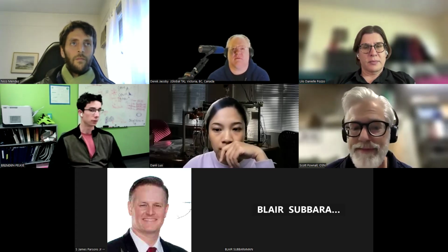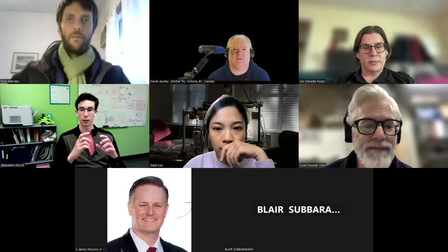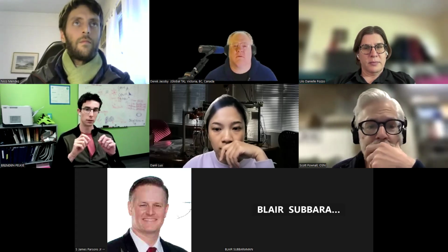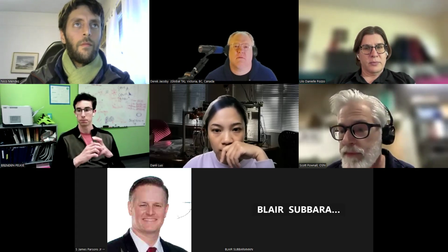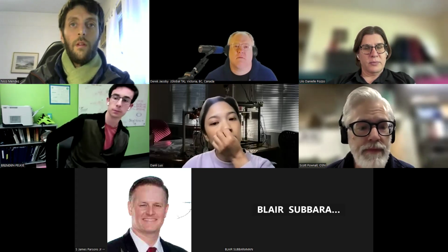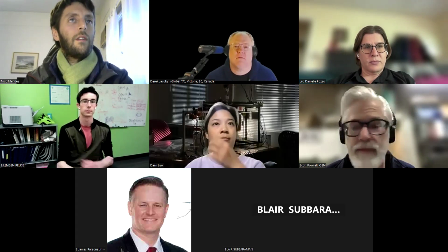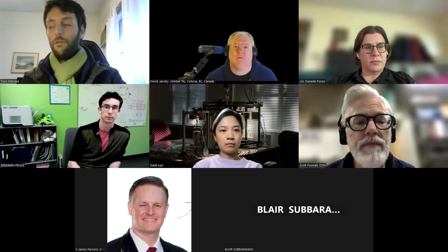I guess I can screen share so everyone can see the links in the chat. These are just another O-ring style that has 2 contact points. And I know this is used for things where you have really fast motion. Just a thought, if you're having issues, it's probably overkill for what we're doing here. But no, I looked, and this one I didn't know about. I would have a look at it. For now, we don't have any issues, fortunately.